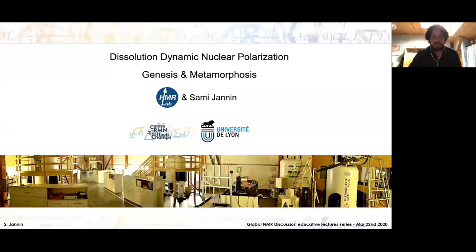So I'll give a 35-minute tutorial on Dissolution DNP, and the objectives are to summarize the basic principle of dissolution DNP and review some applications, a limited number of applications. And then I'd like to present some of the hardware and the state-of-the-art methods of dissolution DNP. And at the end, I will highlight some of the most exciting and interesting recent developments that I think are somehow announcing the new metamorphosis of dissolution DNP into a new version.